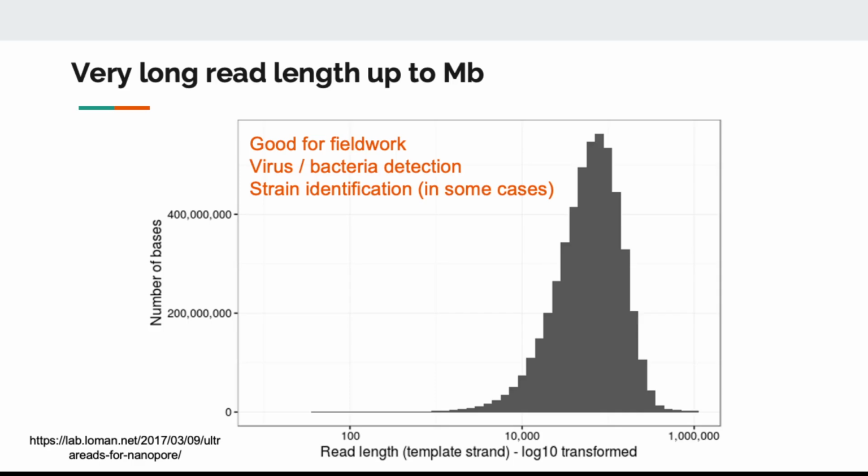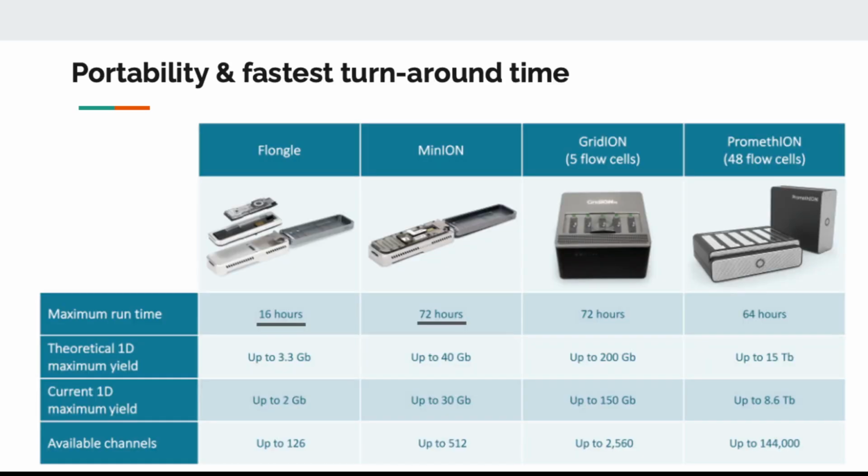And for nanopore, one of the unique characteristics is that it is very portable. Some of you might have seen the actual sequencer before, right? If you imagine the Illumina or PacBio SMRT-seq sequencer, it's going to occupy this whole table, basically. But for nanopore, if you want to sequence in small scale, it's the size of your USB drive.